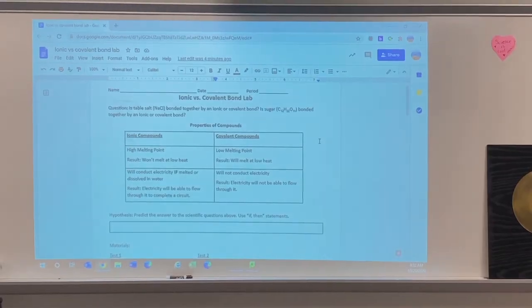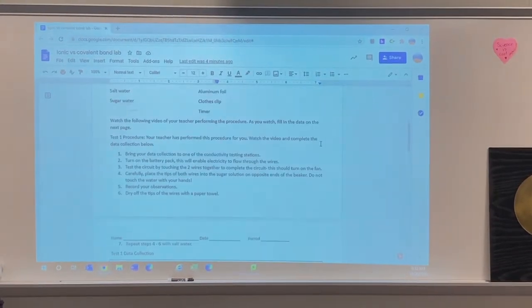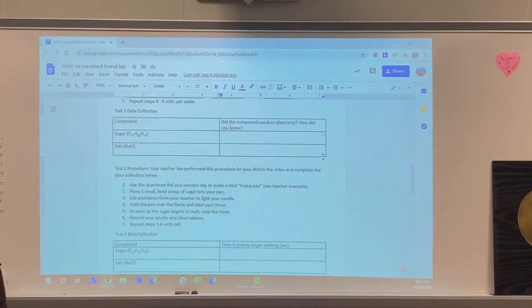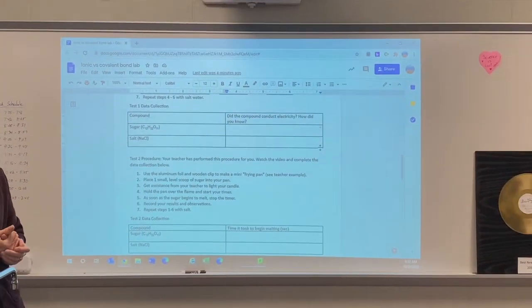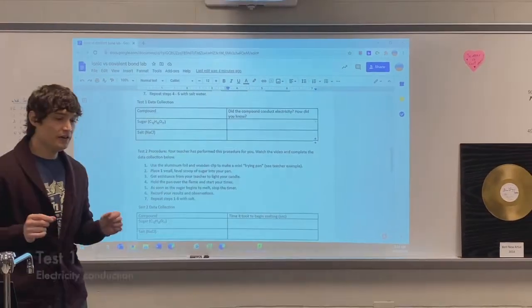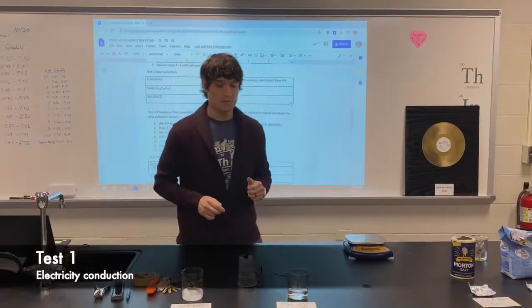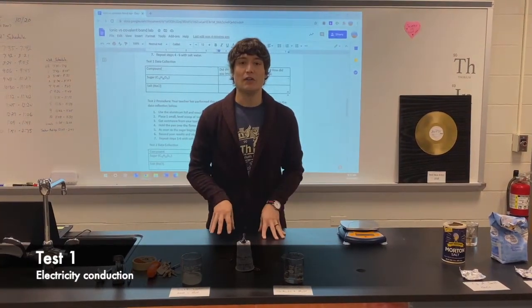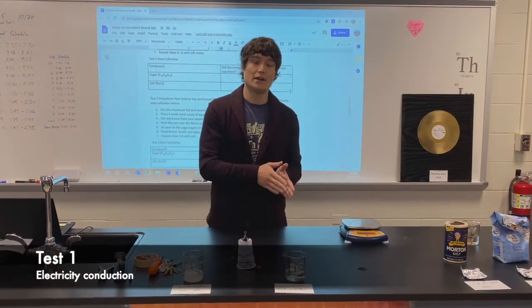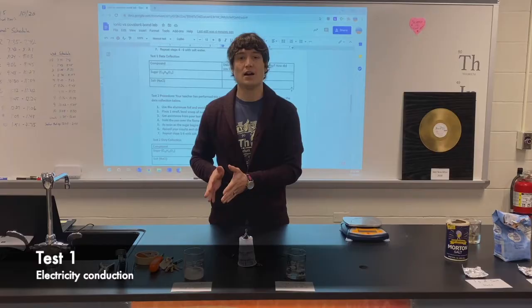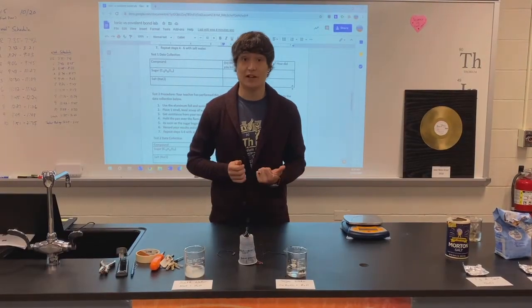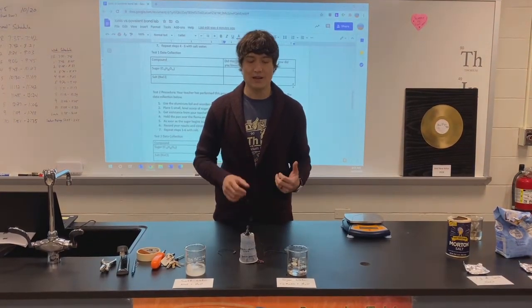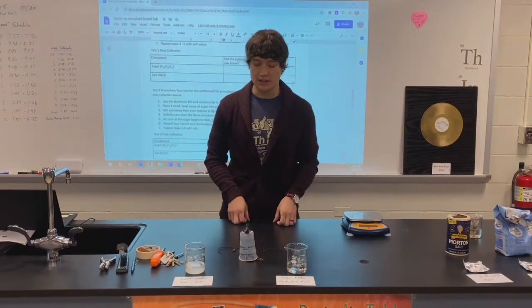You can focus on that on your own time. I'm going to work you through the procedure here so you can get some data for your lab. The first lab we're going to do is take a look at conductivity of certain compounds. Ionic versus covalent compounds — one of them likes to conduct electricity, the other one not so much.